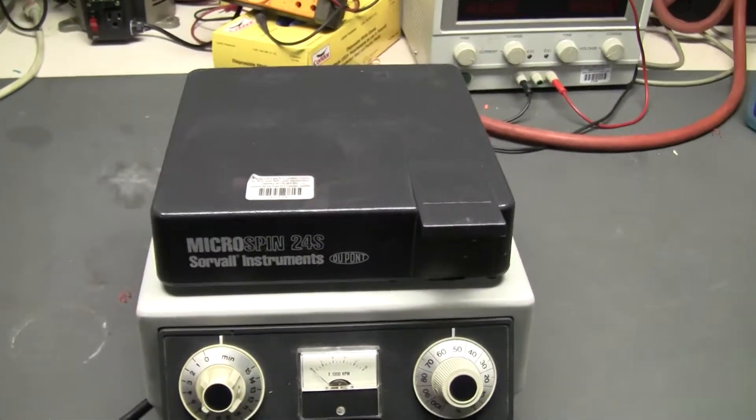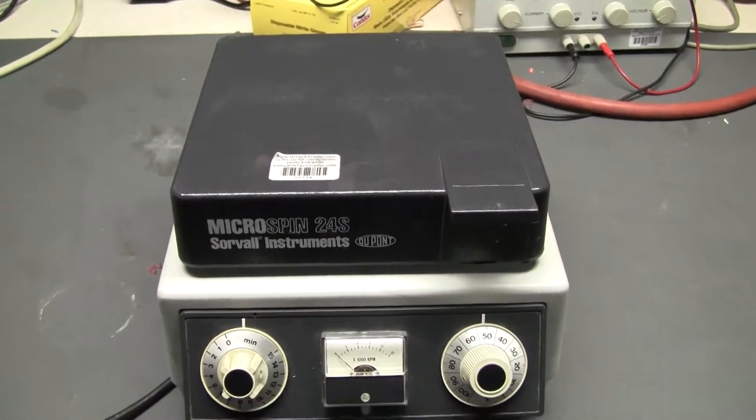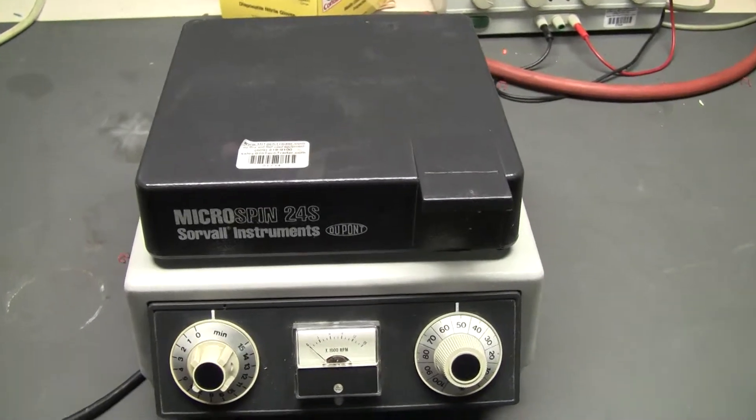Hi, this is Michael from Hitech Trader. Today we're looking at a Microspin 24S Swerval DuPont unit.